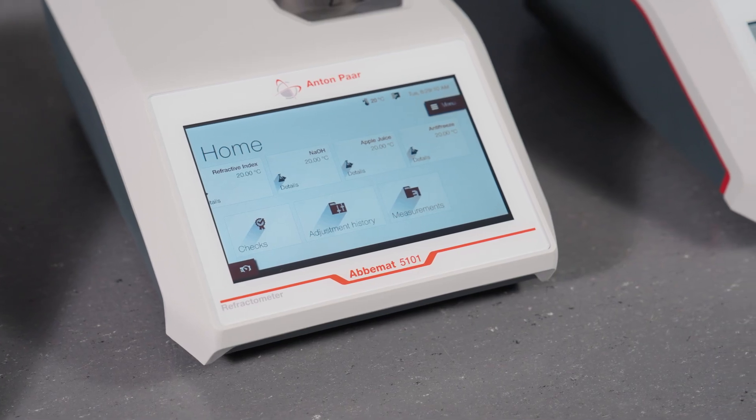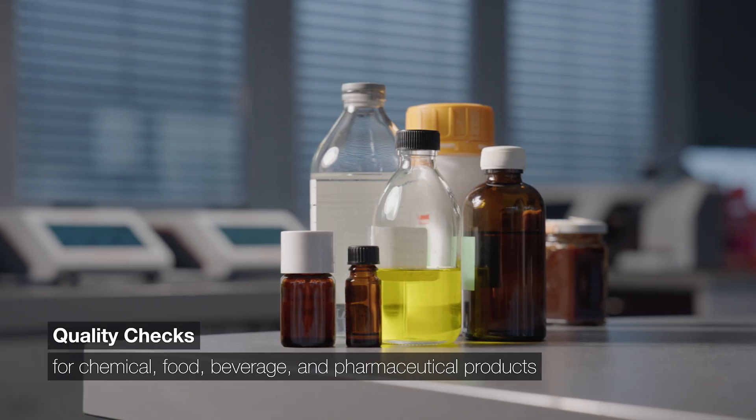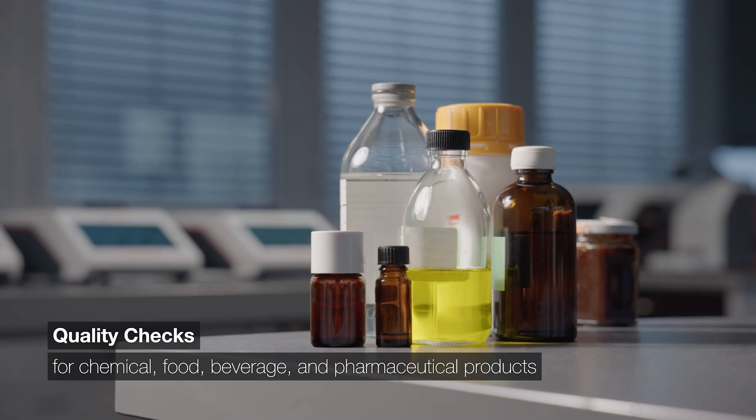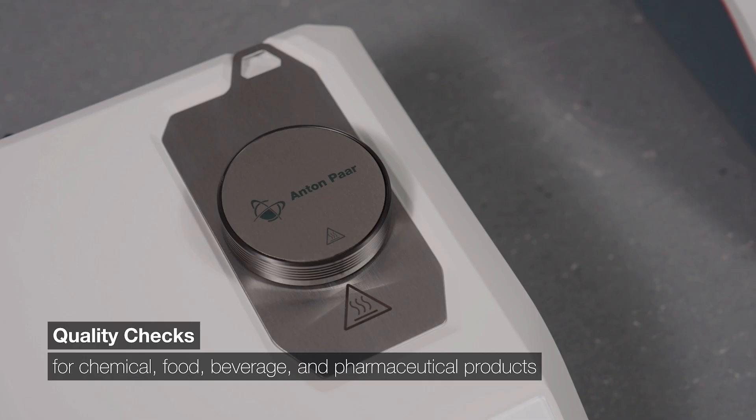The new Abiumat Refractometer series delivers highly efficient quality checks of chemical, food, beverage, and pharmaceutical products.